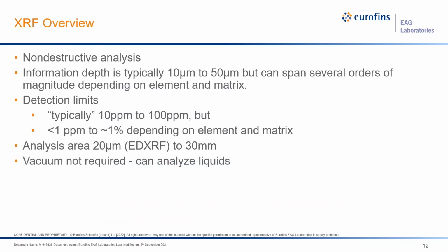This slide provides us with an overview of the XRF technique, but it's worth commenting on these points in more detail. While XRF is considered a non-destructive analysis technique, X-rays in and X-rays out, it's only non-destructive if the material being analyzed doesn't degrade or decompose under high-power X-rays. In fact, some materials aren't that robust. Many polymers will degrade at the high powers that WD-XRF instruments typically use. Glass presents another unique phenomenon. It doesn't degrade, but it will change color, often dramatically.